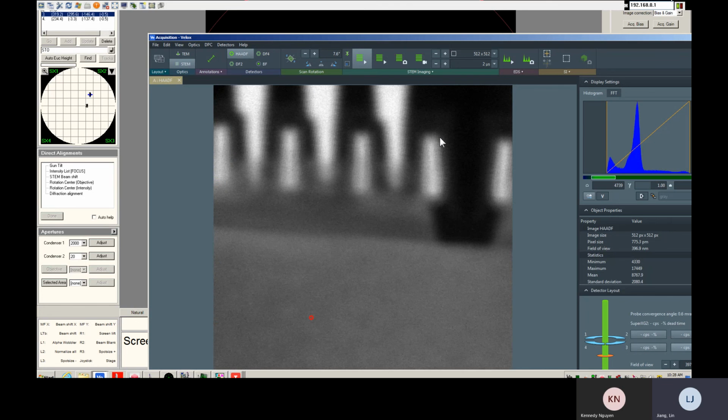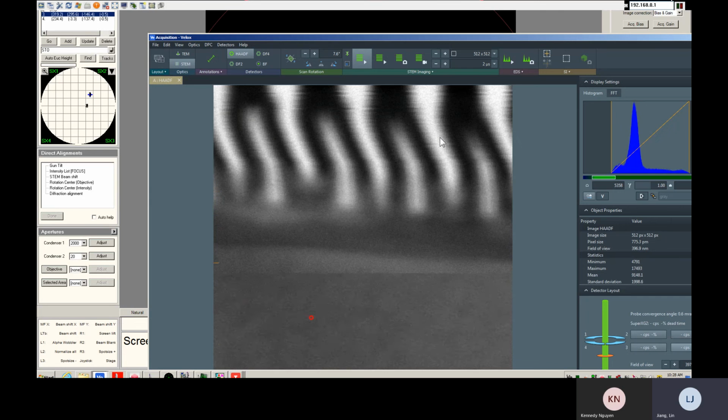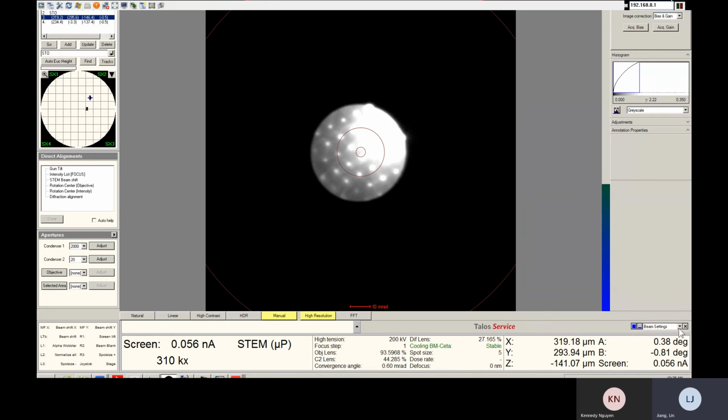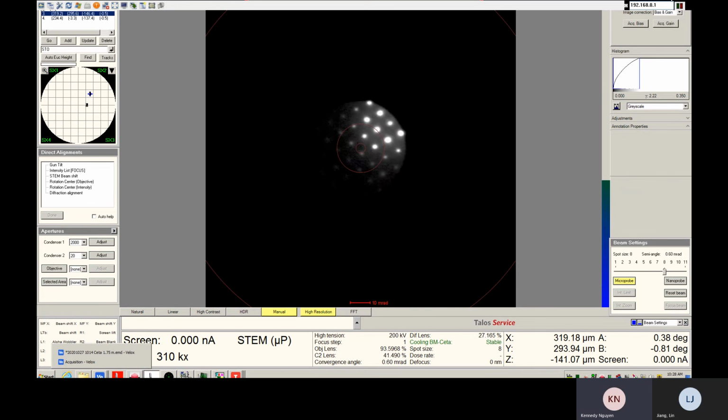You're not going to get a very good image in there because your probe is very big, right? So probably I can choose a little bit larger spot size, meaning smaller spots. In this case, you probably get a little bit better resolution. Go spot size 8. Okay. Acquiring.